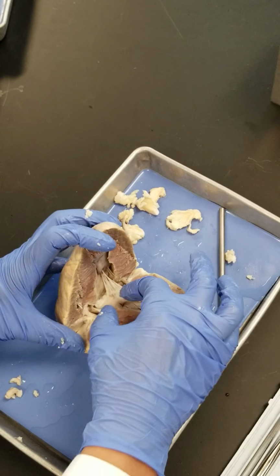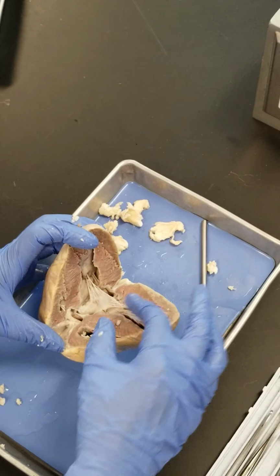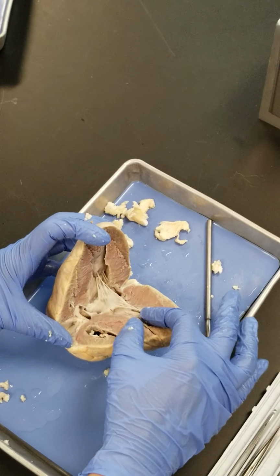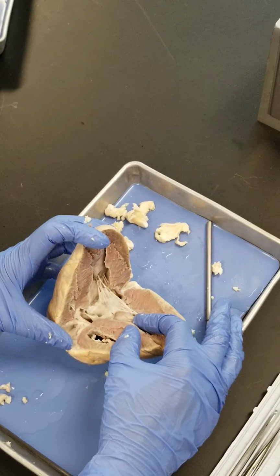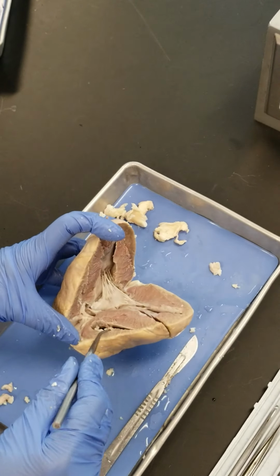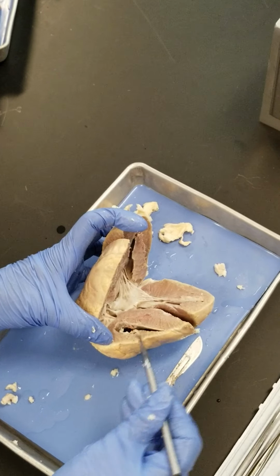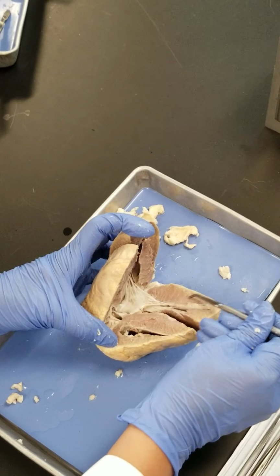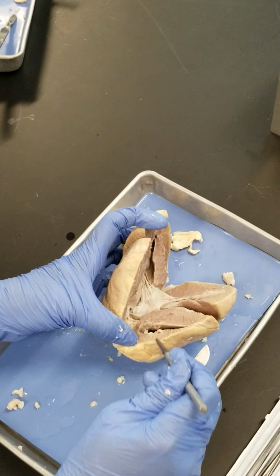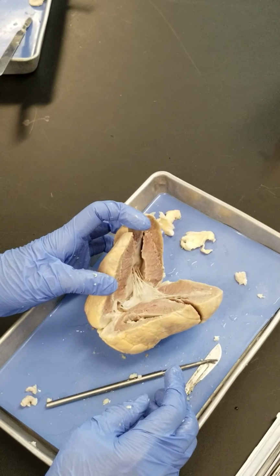Pay attention. You have a wall here, a septum, that is between the two ventricles. That one is not a free wall. That one is very thick, but that's not a free wall. That is the septum. Which septum? Interventricular septum, between the two ventricles. What we are talking about is this free wall, the thickness of this wall compared to the thickness of this wall. You see the thickness is much different between the right side and the left side. And that's all things that you need to find.